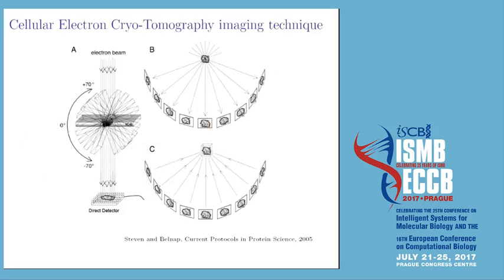The recent advance of cellular electron cryo-tomography has made it a promising tool for studying the native structure and spatial organizations of large macromolecular complexes inside single cells.